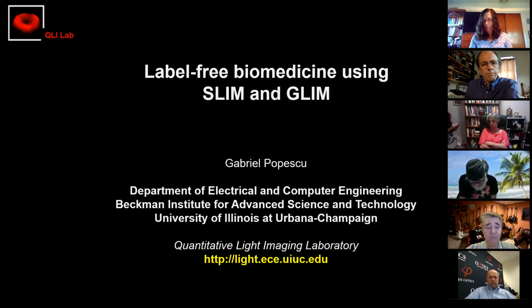Rocks, again, never looked at them. The closest was looking at some roots, right? From Germany, I think we got some samples close to rocks, but still plants. I think it will be fascinating to get some samples like that. I think for rocks, things like that, minerals, you can go both transmission and sometimes reflection as well, I can imagine, for some of them. But we haven't done a lot of those ourselves.